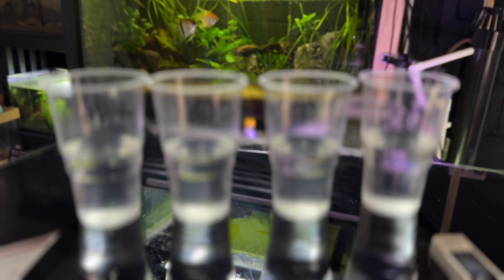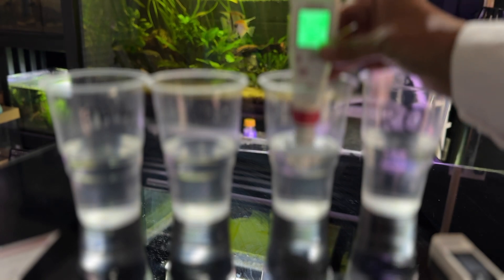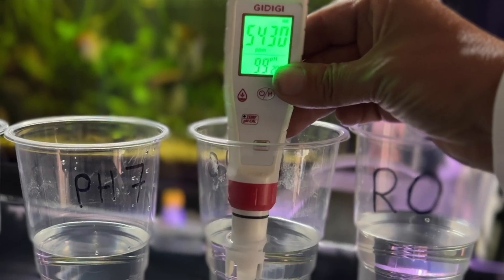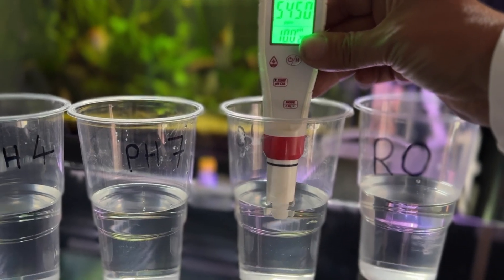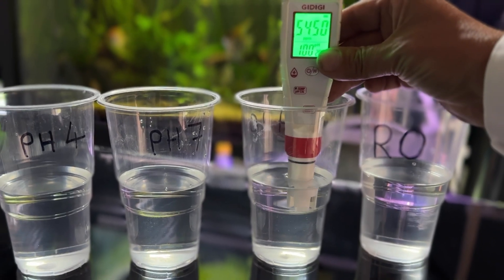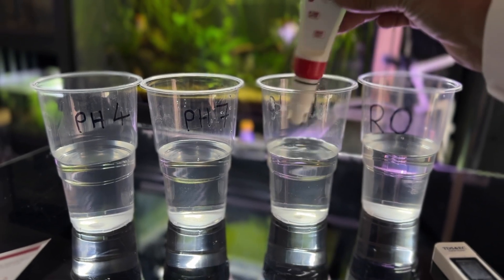Now we'll go to pH 10, see how close we are. It's reading 9.9 in the pH 10 solution, so it's pretty good out of the box. And there — it went to 10. Even better. Rinse it off.